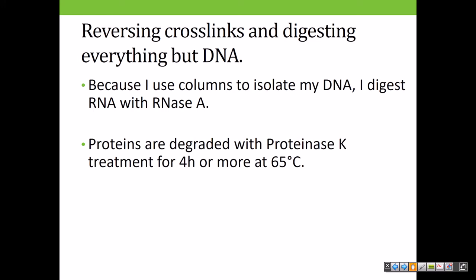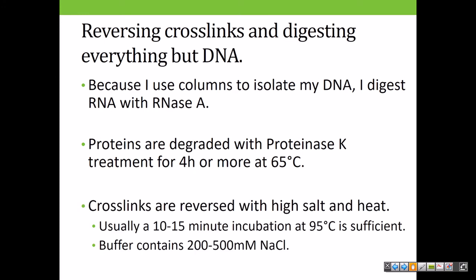Proteins are degraded with proteinase K. The treatment is 4 hours or overnight, depending, at about 65 degrees Celsius. Check the company that makes your proteinase K. Not all proteinase K likes 65 degrees optimally. It should still function, but some like 45, so check your company. The one we use likes 65 degrees. We bought it for that purpose.